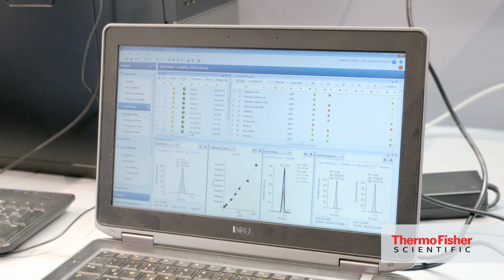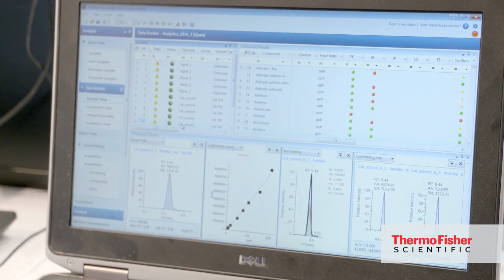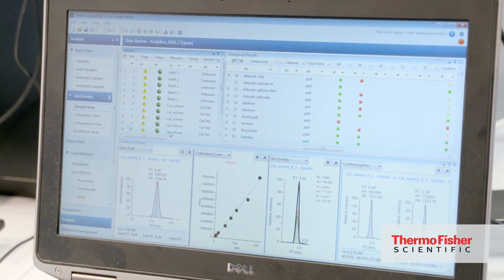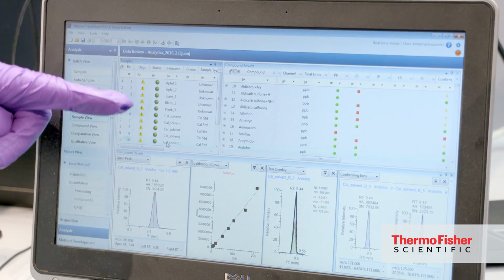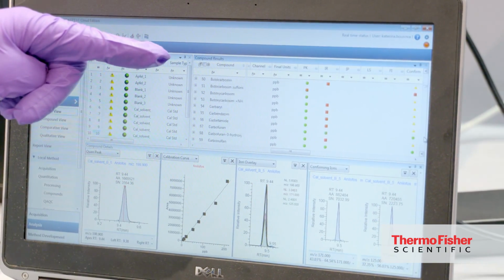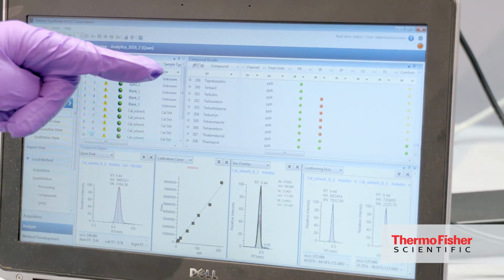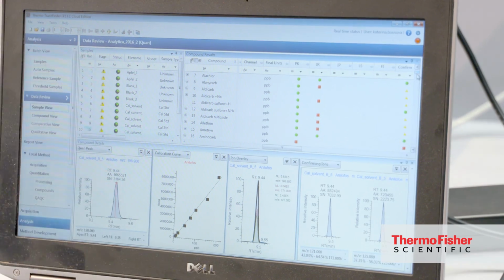Evaluation of the measured samples is done by the high throughput software TraceFinder. Here is a typical panel of TraceFinder where you can see all of the samples that were measured. You can see all of the compounds which are checked. You see that nearly 300 compounds are currently analyzed and screened.